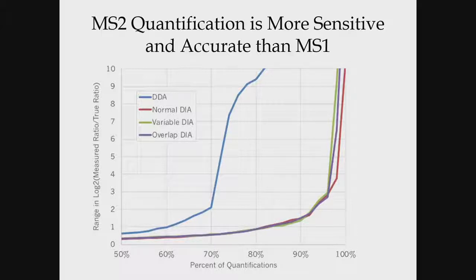The reason for doing that is that if you have a 24 mass-to-charge wide isolation window and you overlap it by 12 mass-to-charge, you can actually figure out which half of the window the fragment ions belong in. We have a manuscript that's just about to get submitted on that. We've been doing it for a long time, but it's taken us a long time to get the manuscript finalized. But the variable window widths, we can definitely handle the data from variable isolation window widths. Quantitatively, the nice thing is that it doesn't really make that much difference anyway.